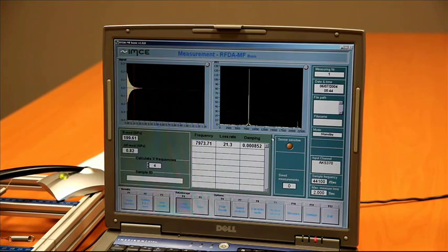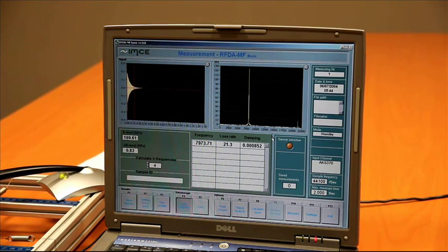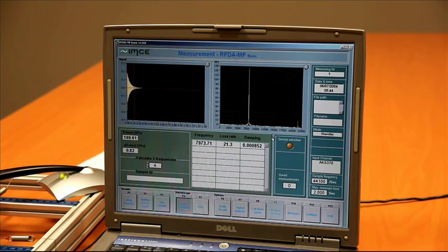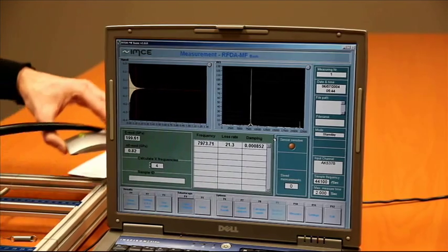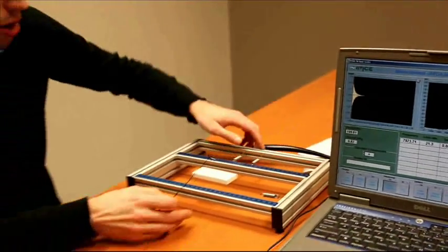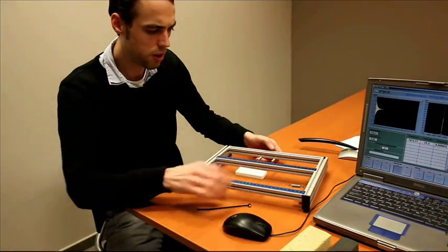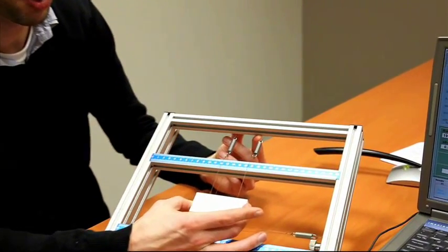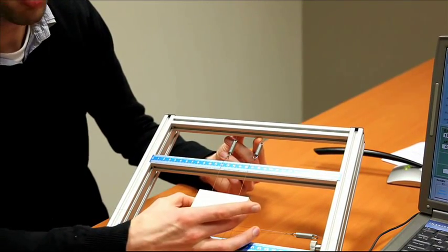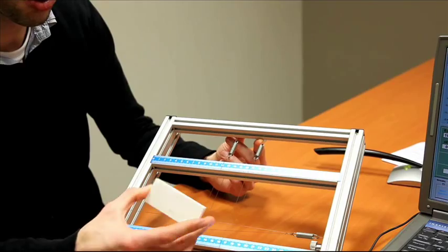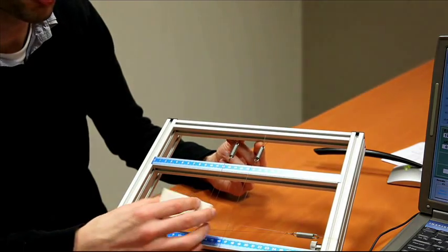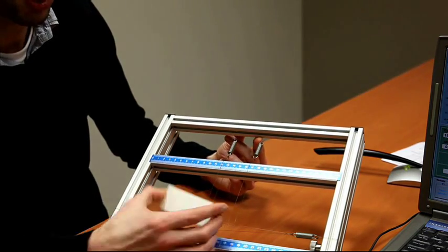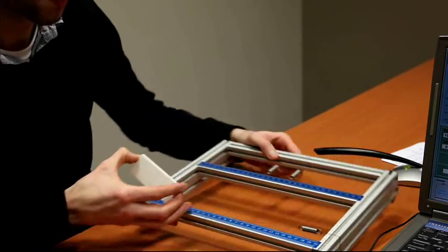We also want to measure the shear modulus and the Poisson ratio. Therefore, we need to induce the torsion vibration mode. And to be able to do that we have to change the setup a little bit. Now we support the sample on two fish wires this way. What we are going to do to measure the torsion vibration mode is support the sample in a cross like this.